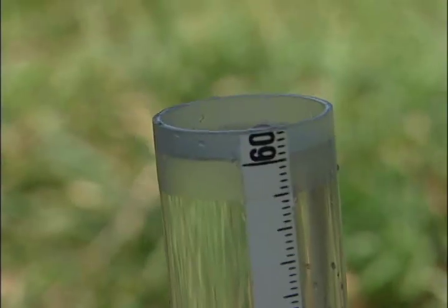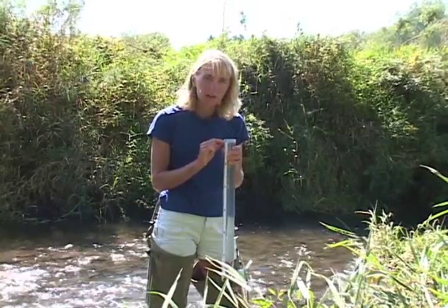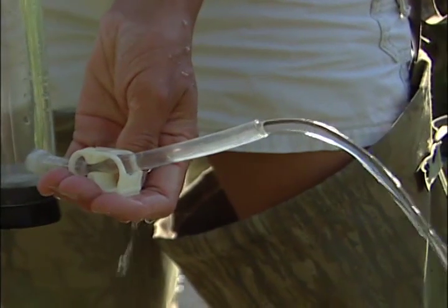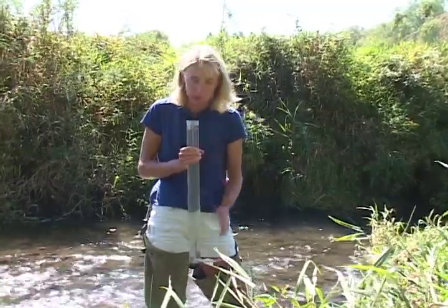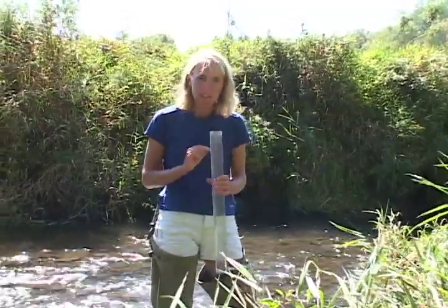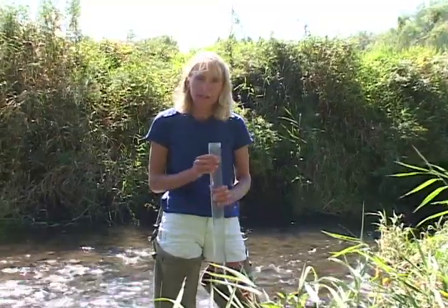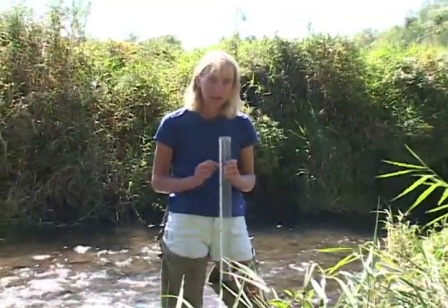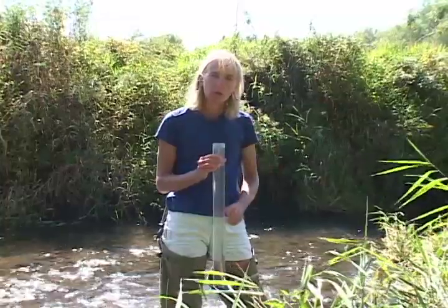If you can see the Secchi disc when the water is filled to the top of the tube, record that entire length of the tube on your recording form. If you can't see it, either use the release valve to slowly release water and look down into the tube, or pour off water a little bit at a time from the top, until you can just barely see that Secchi disc in the bottom, and then record that height of water on your recording form.